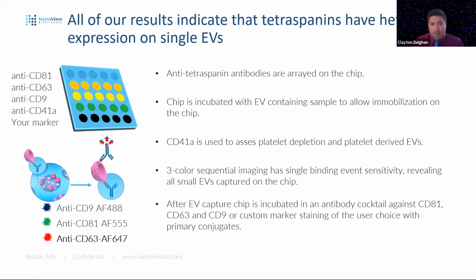They're arrayed on the chip. Chips incubated overnight with the EV-containing sample, and the EVs that display each of the positive markers will be immobilized on that spot. We use the CD41A to assess platelet depletion, platelet-derived EVs. Going to be very important as we go forward here.